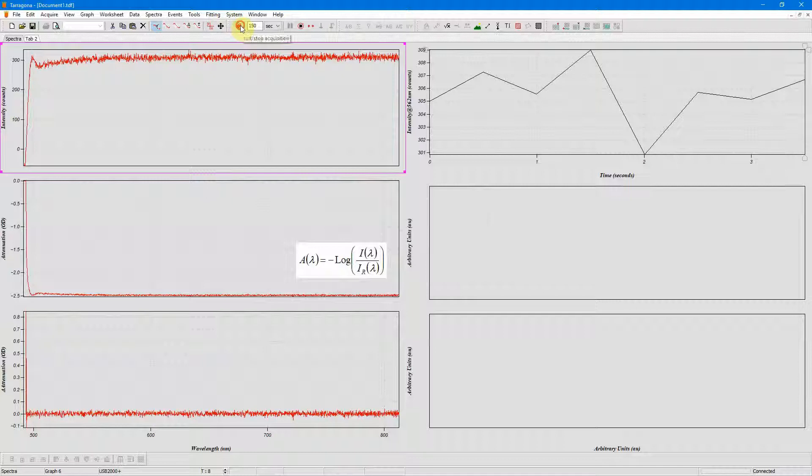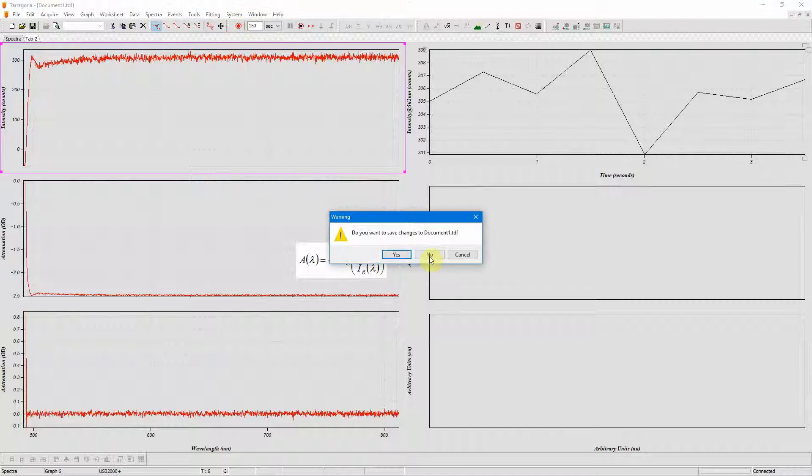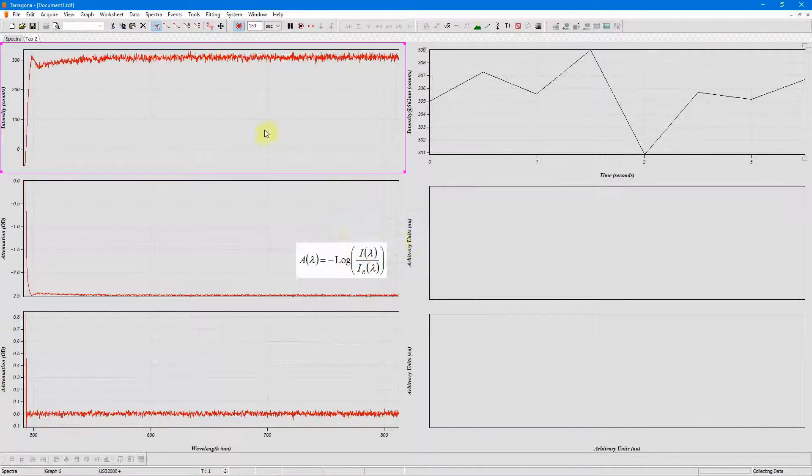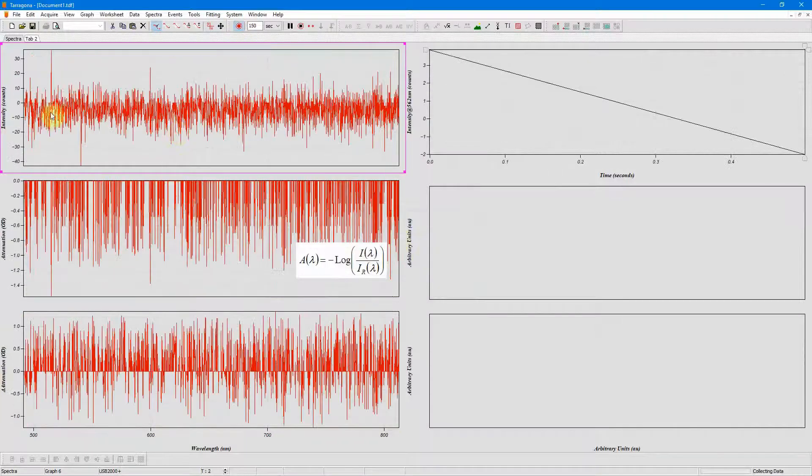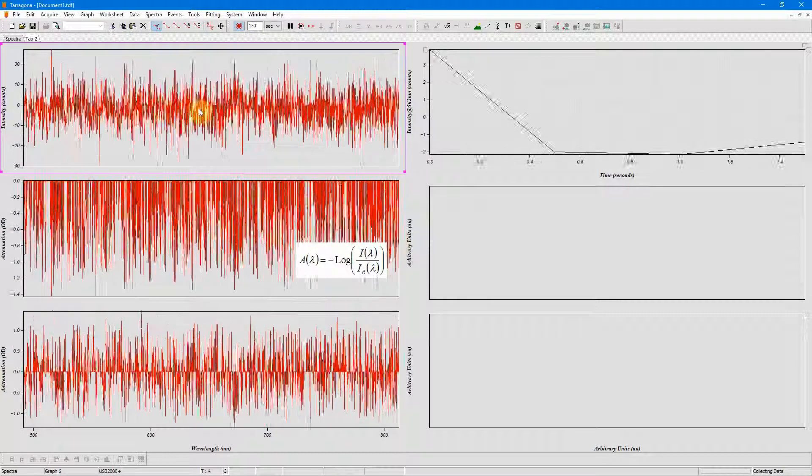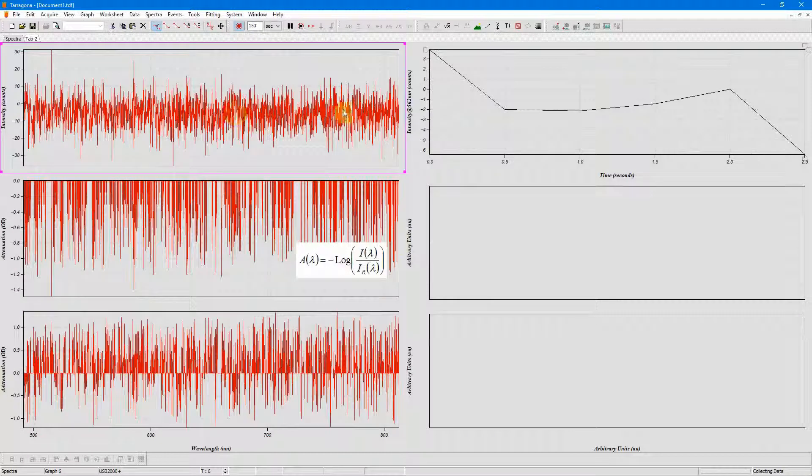Now when I click spectra you can see my intensity spectrum is now flat and zero.